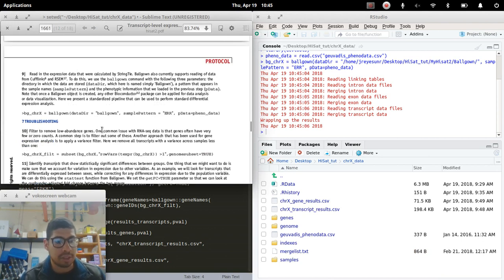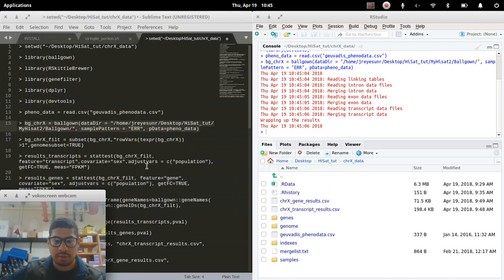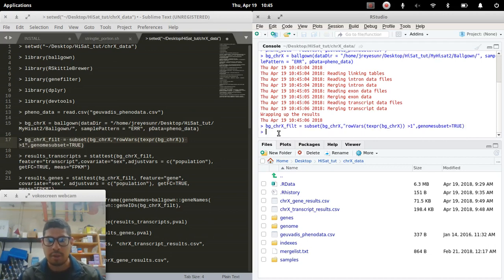So we're going to be getting rid of those which have few or even zero counts. So we're going to go over here. And now we have it set up.